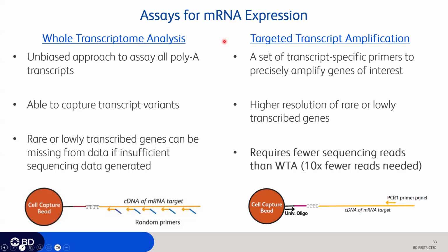Because we're only targeting genes that we care about, this is a very high resolution and sensitive assay. However, we will not find what you are not looking for. So you do need to know ahead of time your genes of interest here.